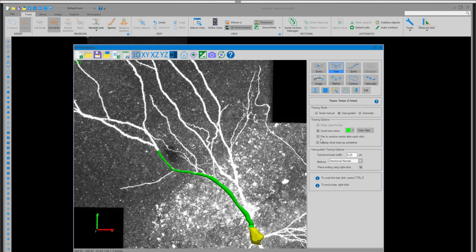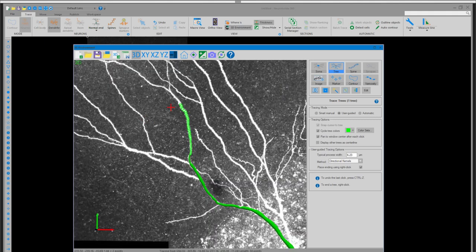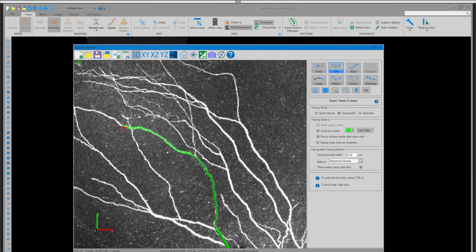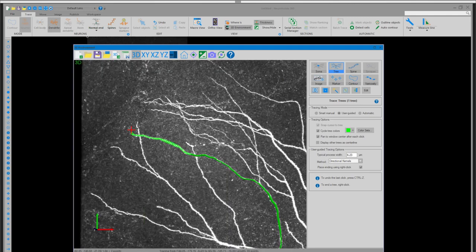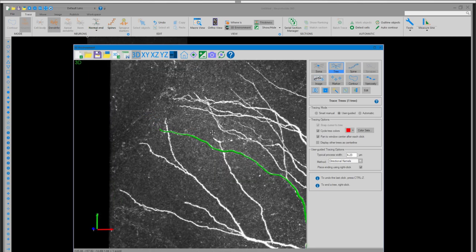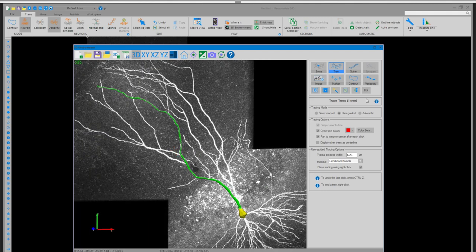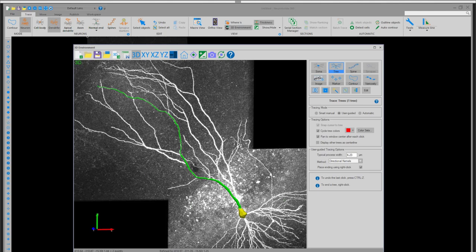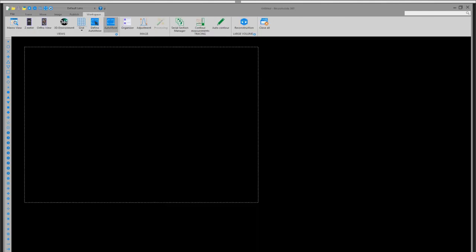Another quick feature is pan-to-window-center, which allows an automatic move within the 3D environment based on your last mouse click — so you no longer have to manually pan through the image. Now let's jump into the Large Volume Reconstruction mode. There are some questions coming in about working from home, and LVR is something to highlight right now.